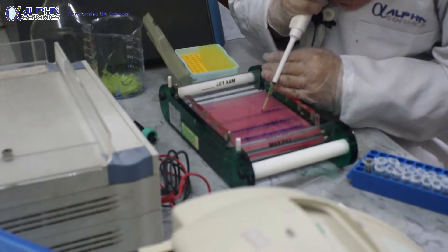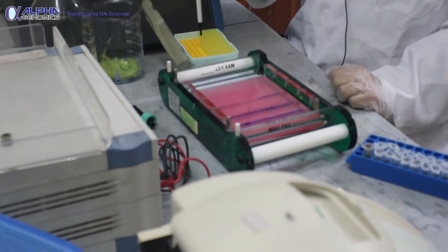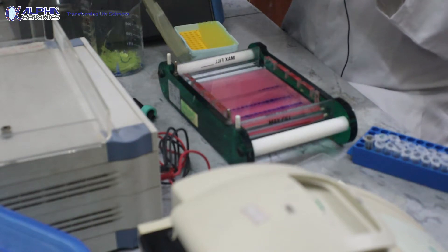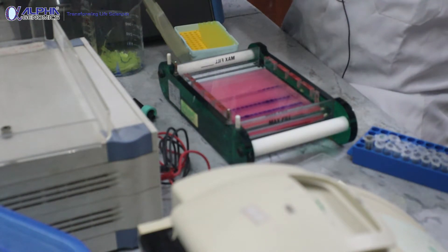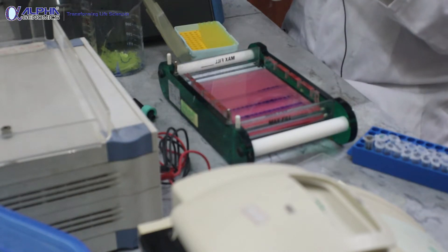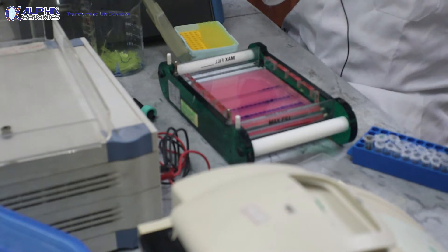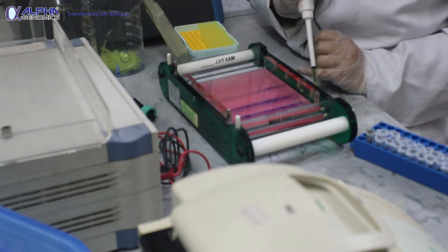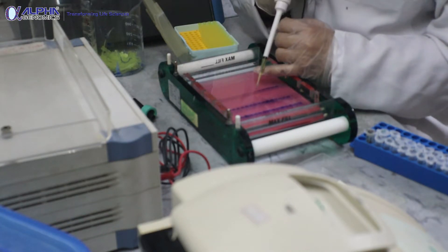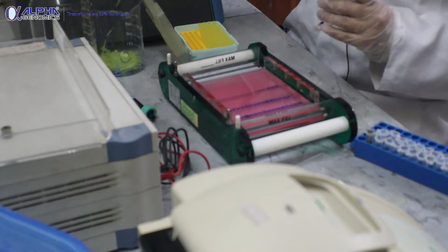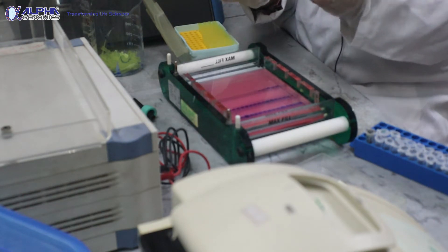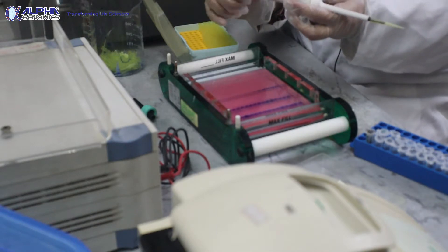Coming back to 1% agarose gel, for the preparation we normally use two kinds of buffers: TBE (Tris boric acid and EDTA) and TAE (Tris acetic acid and EDTA). They are dependent upon the concentration - what kind of concentration you're using. When you prepare these stock solutions they are normally in concentrated form, typically 10x or 50x.